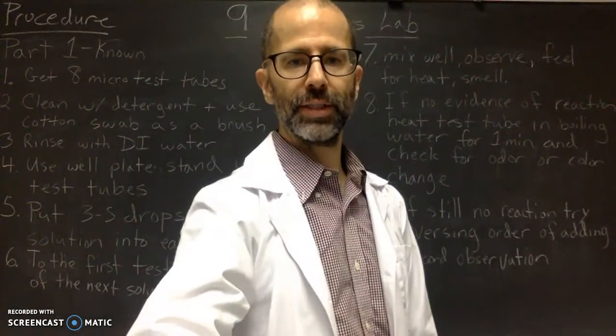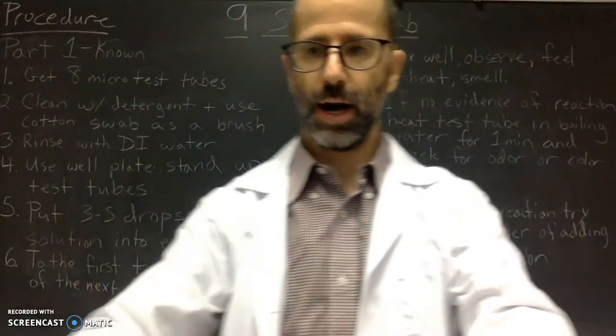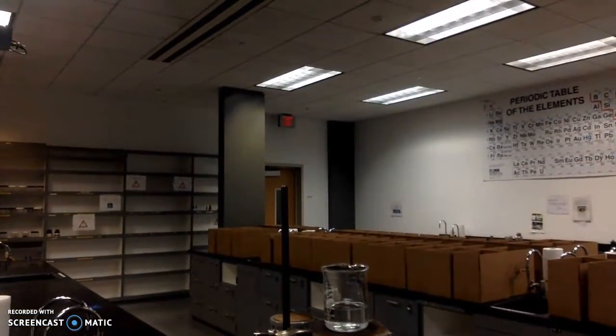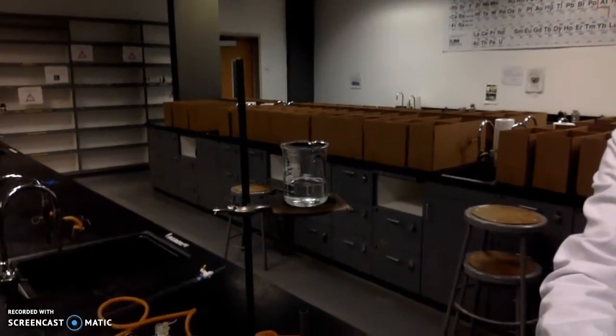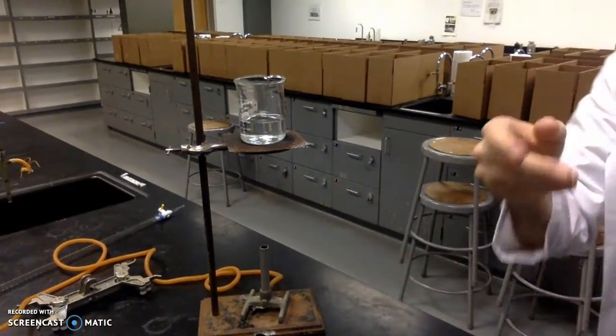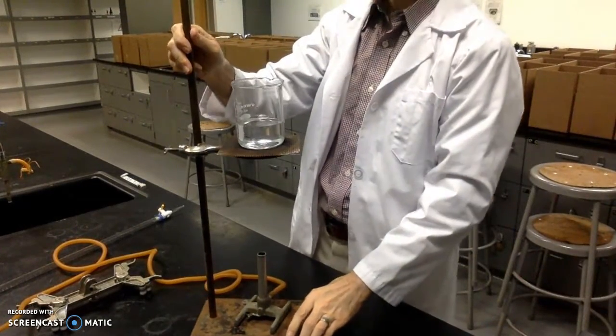And the way you're going to set up your boiling water apparatus is like this. So let me bring this down. So you're going to have your ring stand.